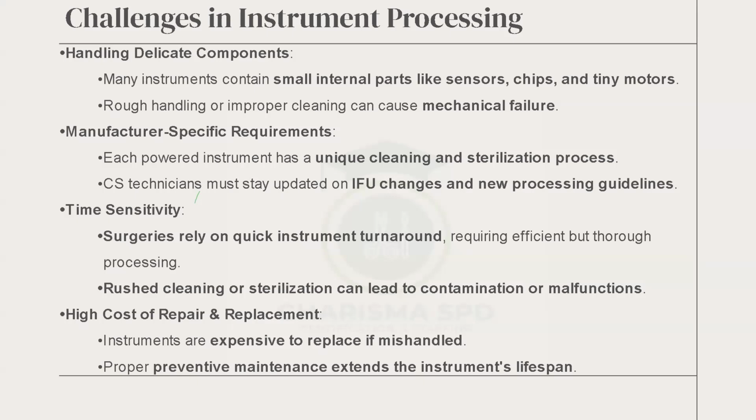Instrument preventive maintenance extends the instrument lifespan. I can't overemphasize that. You keep it properly, it lasts longer. If you always maintain your car, it always sounds new and always looks new. If you don't maintain your car properly, what happens? It looks wretched, and sometimes you don't enjoy driving it. You see somebody's car and you think, I wish I had this one. You could keep yours the same way. So please, let's do the right thing when we get into the department. Any question before we get to the next slide?